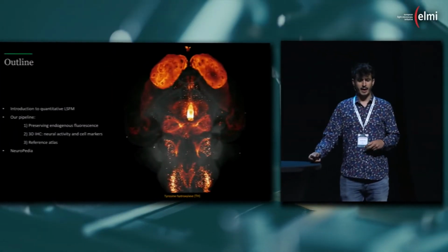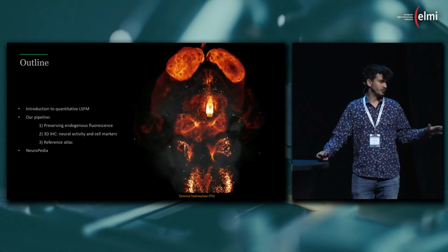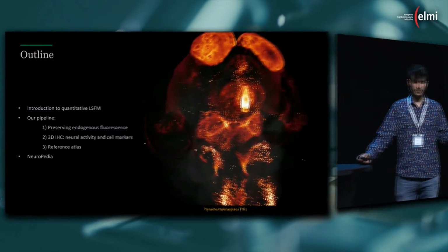So as I said, I'm a scientist at Cupra, and we are a biotech that, among other things, specializes in applying light sheet microscopy in clear samples in preclinical drug discovery. I will first give you a very brief introduction of the light sheet process that we use.